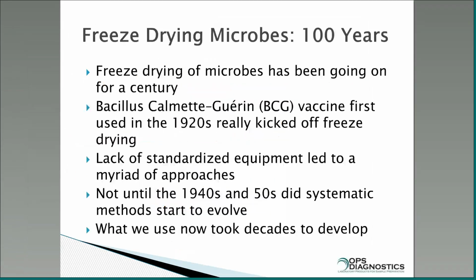Okay, so freeze drying has been around for quite a number of years. It's over 100 years old. Some of the earlier works were 1910, that area. It really started to develop as a technique in the 1920s when the BCG vaccine came out, and that was a vaccine that was used against tuberculosis.